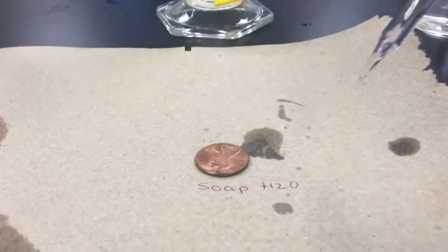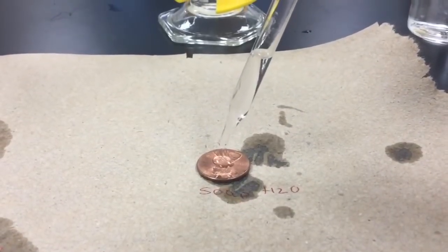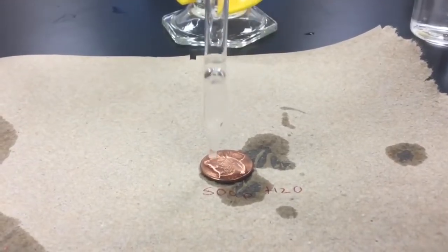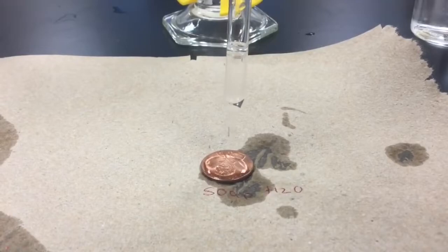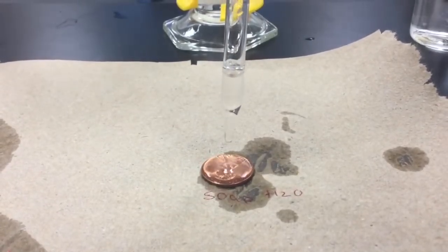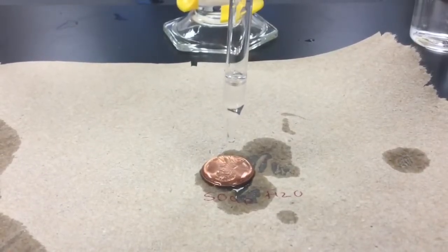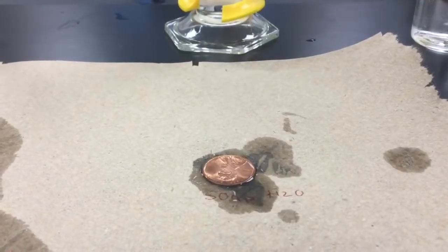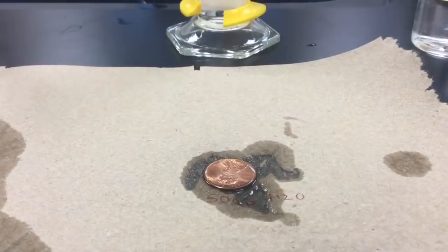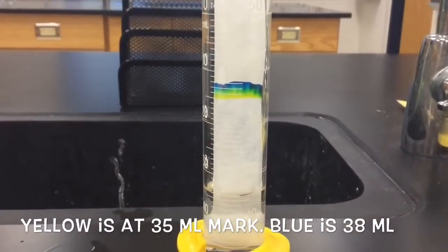Here's our soapy water penny. One, two, three, four, five, six, seven, eight, nine, ten, eleven, twelve, thirteen, fourteen, fifteen, sixteen, seventeen, eighteen, nineteen, twenty, twenty-one, twenty-two - and it overflowed. Significantly fewer drops than the tap water penny.